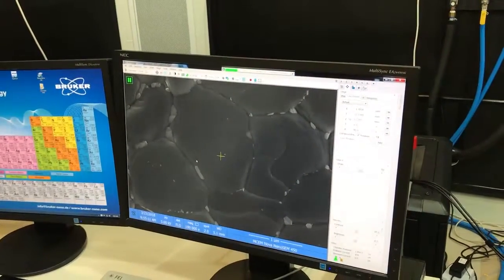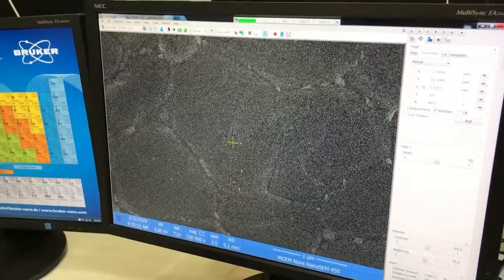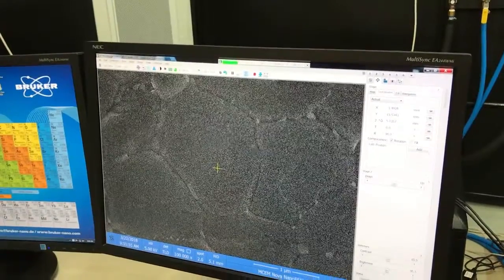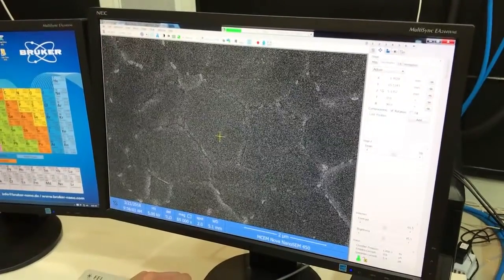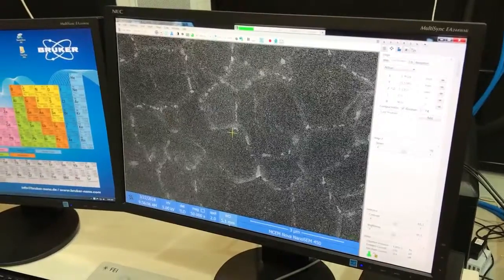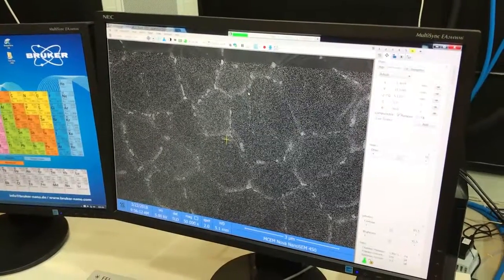So you just saved that one, did you? Yep, that's right. Great. So you guys will get that image. And now it's back to fast scan rate. You can see the line moving from top to bottom very quickly, and that's indicative of a very fast scan rate. It allows you, when you move things, to reduce the lag time between your actions on the microscope and the effect on the image.